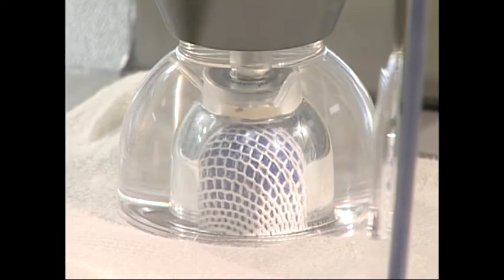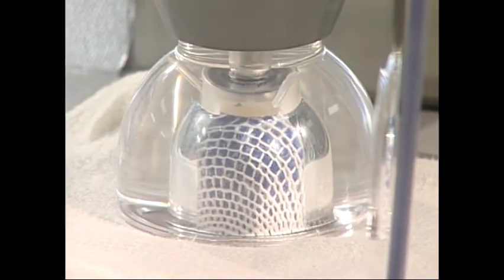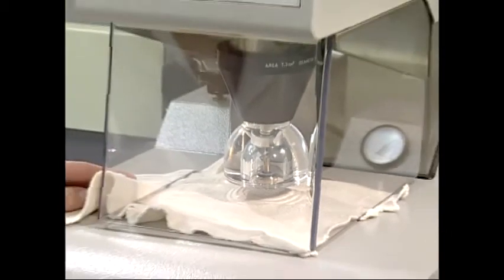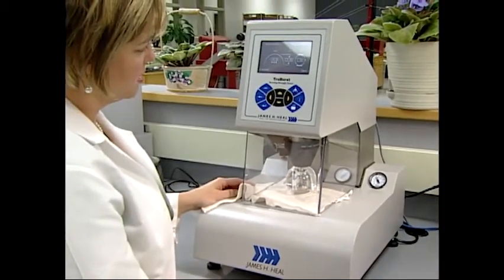With some constructions, the fabric stretches excessively, and the test may be stopped at some predetermined level of elongation. The difference between the total pressure required to rupture the specimen and the pressure required to inflate the diaphragm is reported as the bursting strength.